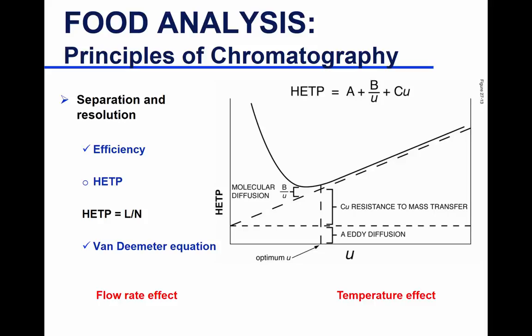As well, you'll learn this more in GC, is when you have a capillary column. Here it is hollow, there's nothing, and your stationary phase is a thin layer. So equilibrium happens really, really fast because you don't have much room for your solute to go in and stay long, it's just a thin layer. That's why resolution in GC is much better than HPLC, especially when you use capillary columns. You have really sharp peaks compared to an HPLC peak that could be a little wider.